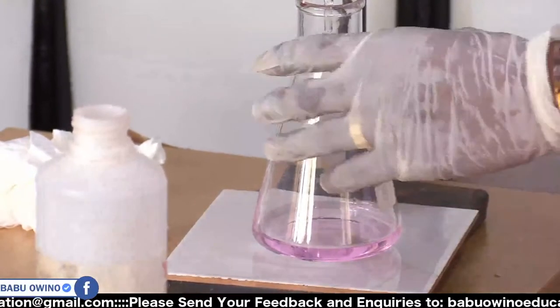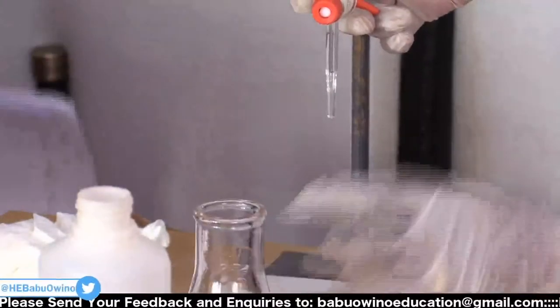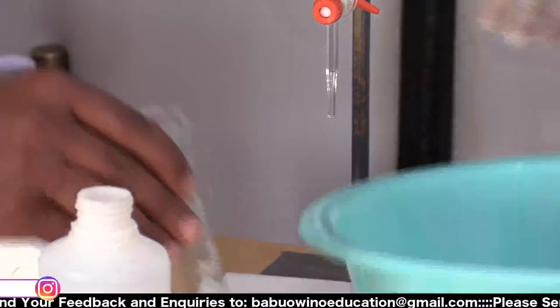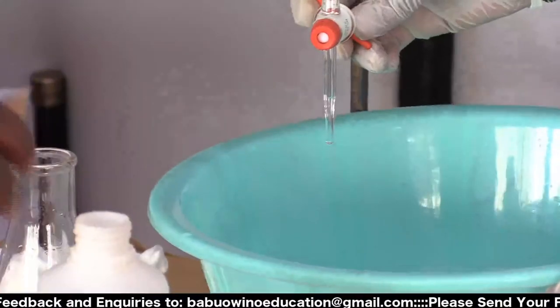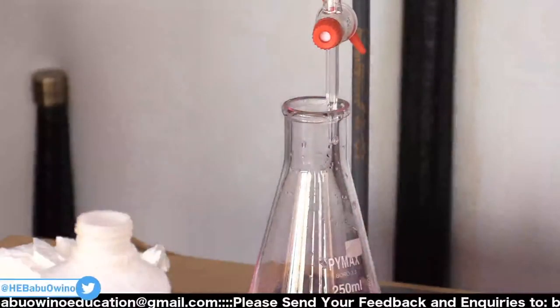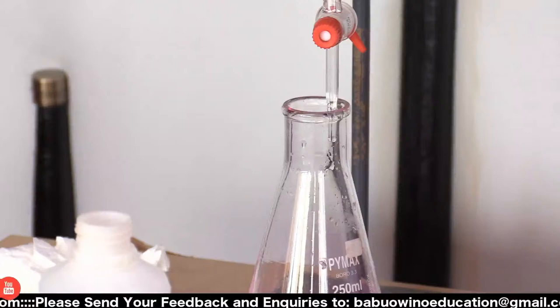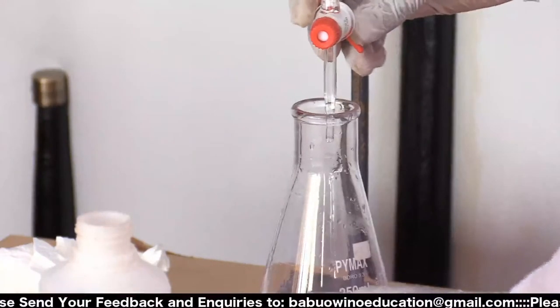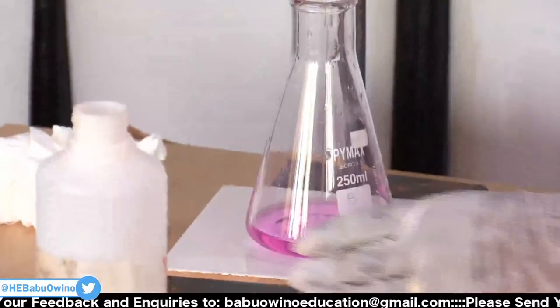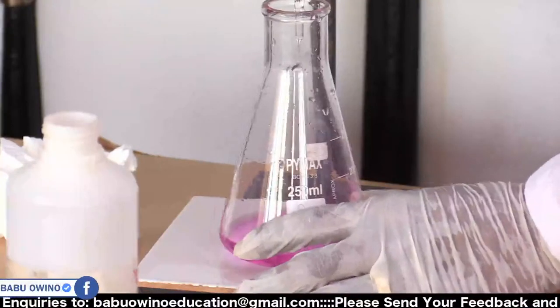Continue. No, I did not release it, so I release faster. So we start. Our first value changes because we did not release it. It changes to 12.8. Oh, fine. Let's move on. This is the first titer we are doing. So we'll take another one so that we are consistent.